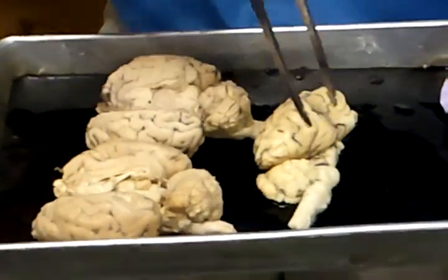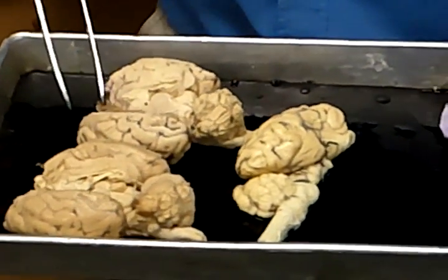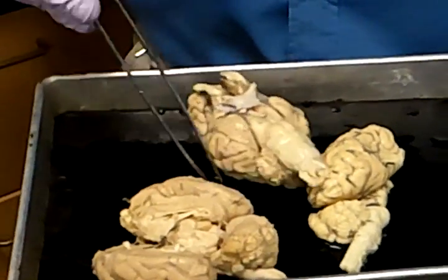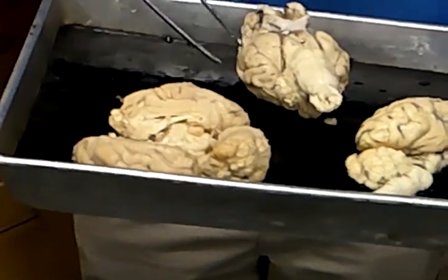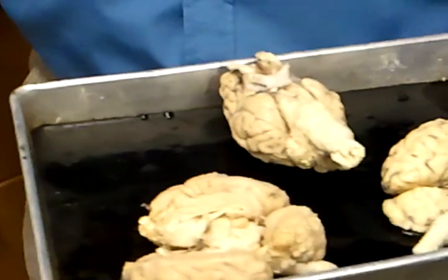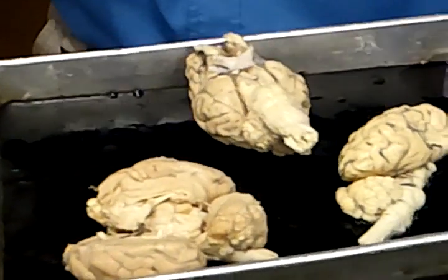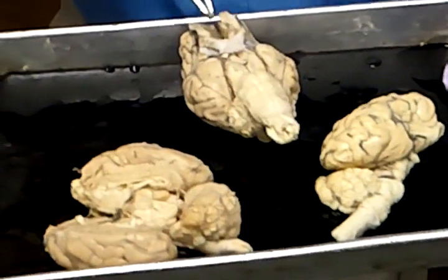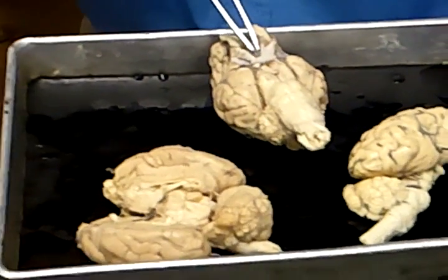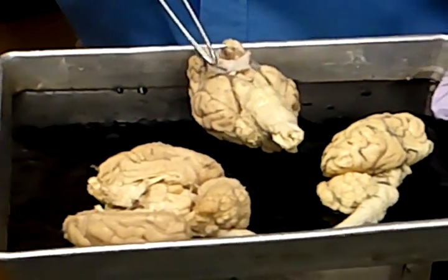The cranial nerves, you just have to memorize. We will make sure you have a particular specimen that's got some cranial nerves intact to find. Does this guy have much of anything? Not really. We have to go fish because they get damaged every year. There's a whole unopened bucket back there where you open up new bags and fish them out. But if you know that sequence up there, you'll get it. So this is cranial nerve 1. Where it crosses is 2. And 3 and 4 are somewhere in this region. We'll have to pick them out for you.